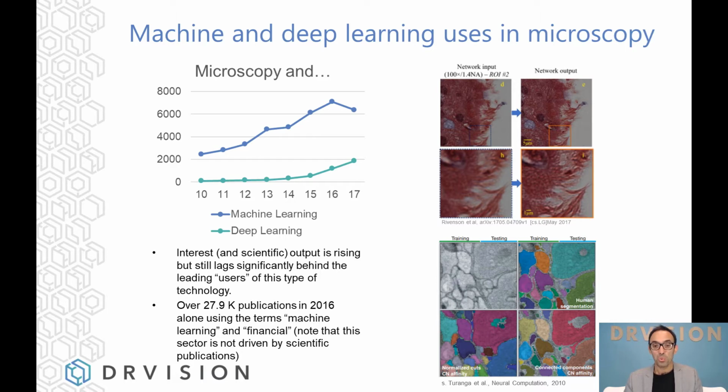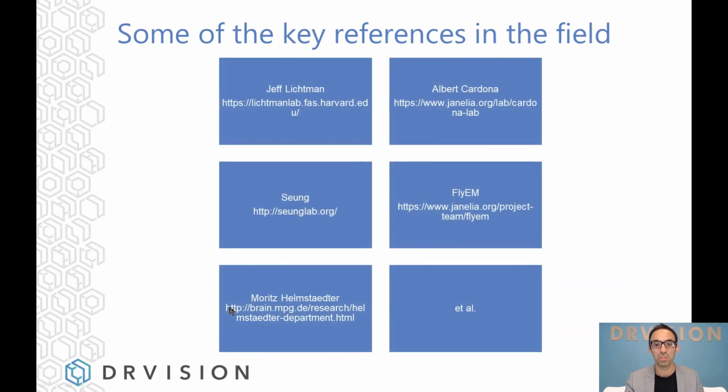I think we are just at the beginning of the use of deep learning for analysis or segmentation of microscopy images. And we're very excited to share with you today some of those benefits, and hopefully you'll try it and you will like to use it.